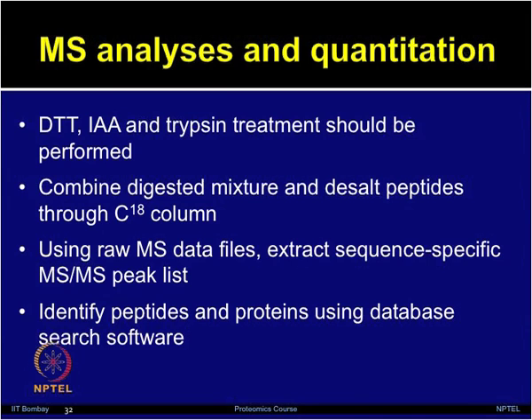These treatments should be performed, and then the combined digested mixture and desalted peptides can be further used. The desalting can be performed by using C18 columns.